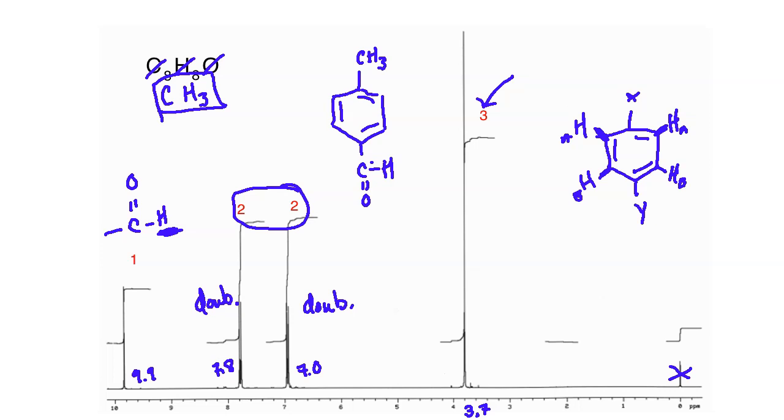So hopefully everybody has got a grasp on this, and I wanted to go through and show you and prove to you that you can do this type of problem solving simply through using your Proton NMR. That's how important Proton NMRs are. Now, it is obviously better the more information you have, so you want to try to couple them with carbon 13s and IRs and mass spec. So up next, we will take a look at that practice session that's going to tie everything together.